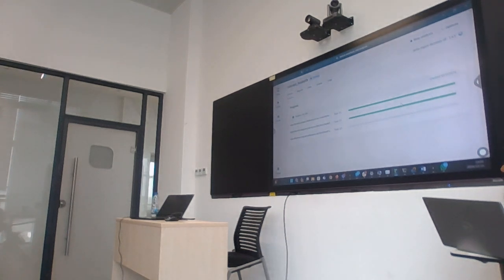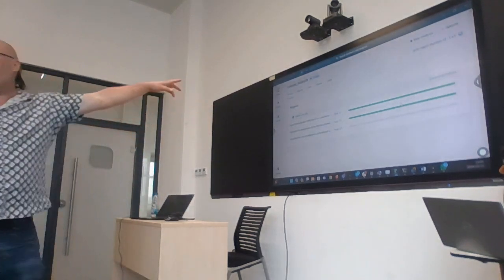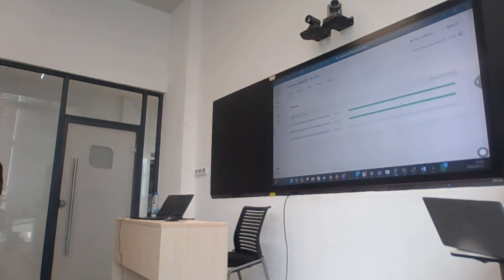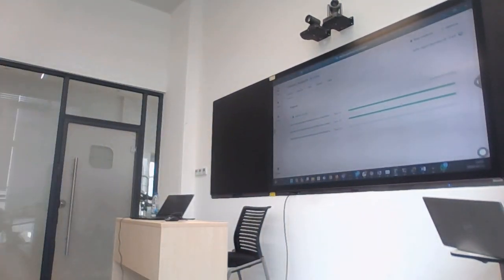The second step is fetch hostile something or other. Everybody should see it go past that quickly. Has anybody's workflow stuck on the second step, the fetch hostile reference? If it's stuck there, then there's something wrong with your configuration. Let me see what you've got.